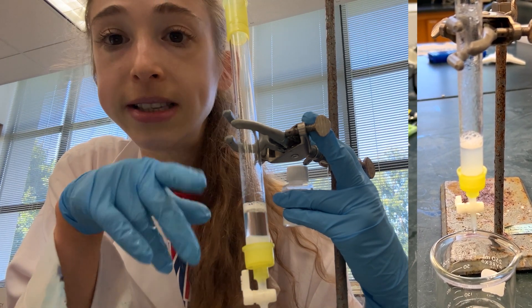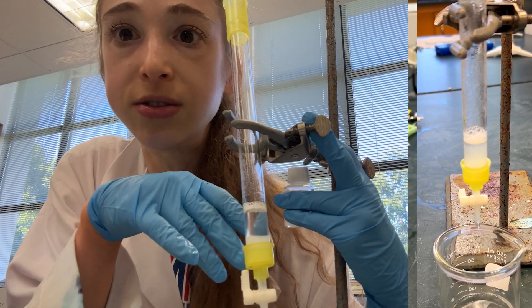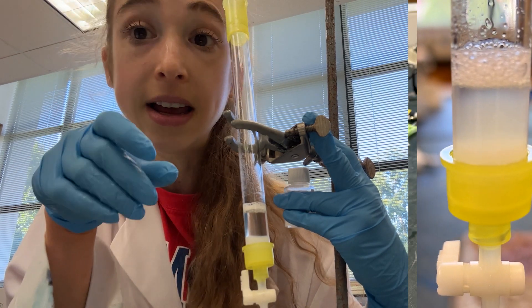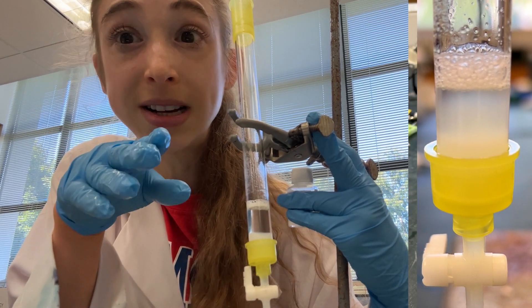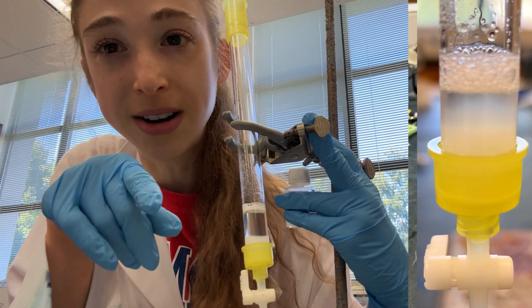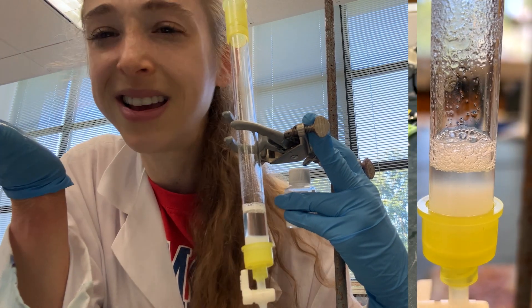It's also helpful when you regenerate your resin — afterwards you can often regenerate it with some sort of high salt wash or high competitor wash, followed by a high salt wash. There are more detailed procedures if you have protein stuck on your column, but you should be able to regenerate the resin to use it again and again. You won't want to put it back in the original bottle though — instead, put it in a labeled tube associated with the protein you used that time, because you typically only want to use the resin for the same protein. You could do a purification of a different protein, but it's better to avoid contamination between different proteins in case a little is stuck on there.